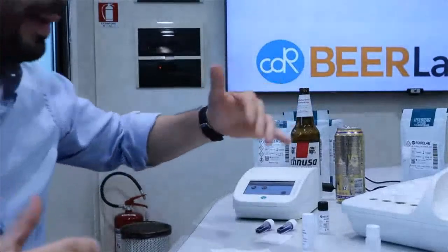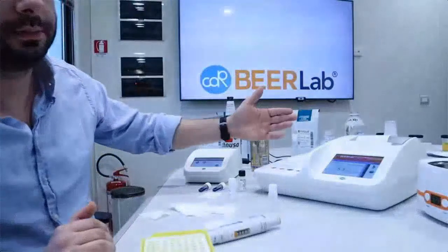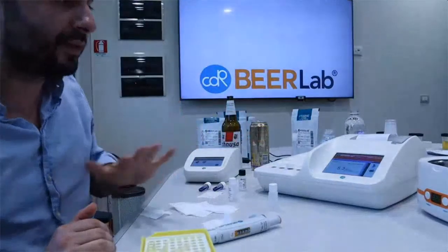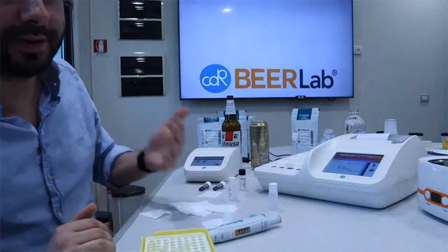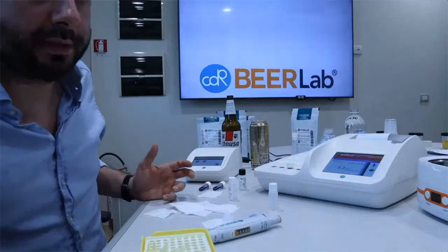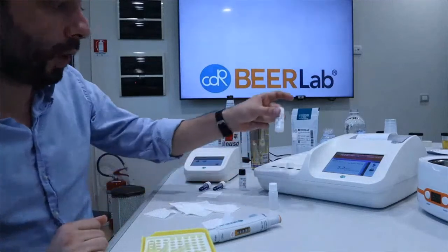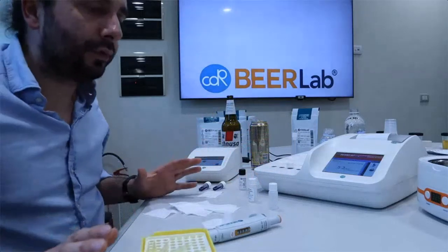So this is the BeerLab. Here you have seen the alcohol; the free amino nitrogen is practically absolutely the same without the dilution, so it's even easier. For SO2, you have to wait 1 minute with only one reagent. Anyway, the handling is the same for all the analyses.